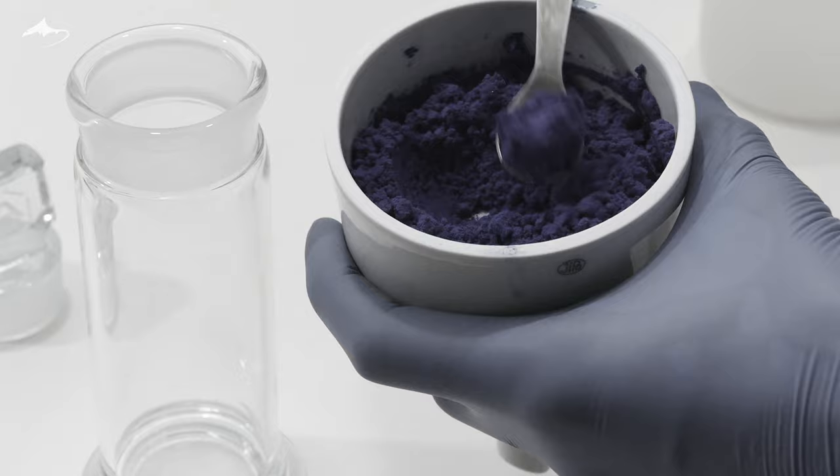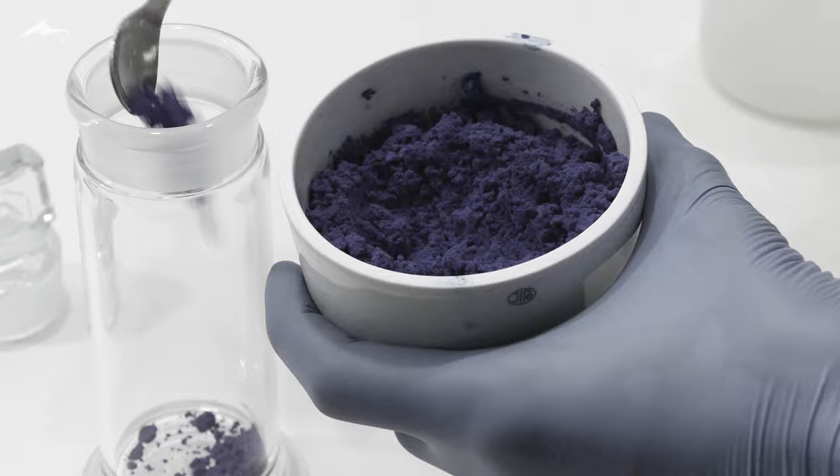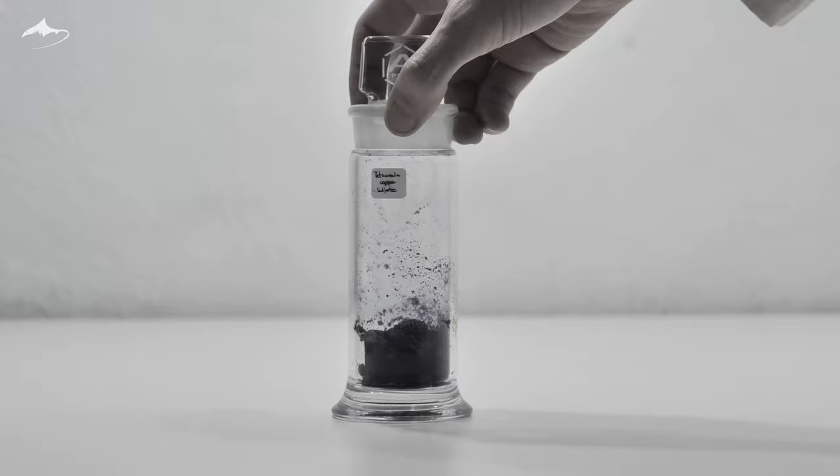Welcome. In a past project I prepared about 20 grams of tetramine copper 2 sulfate monohydrate, a violet salt in the form of powder. I decided to try to recrystallize it as I could not find much information about this process online.